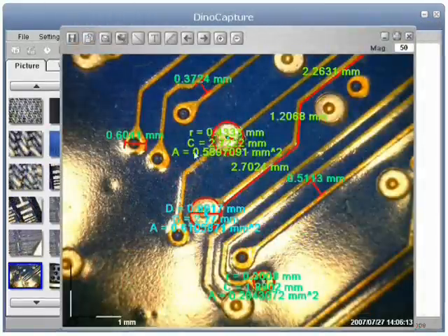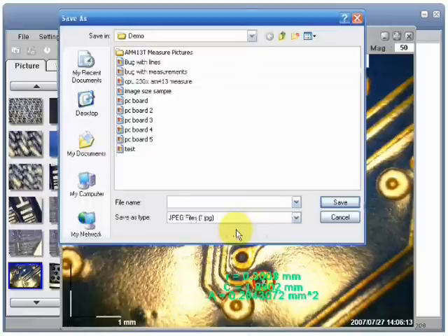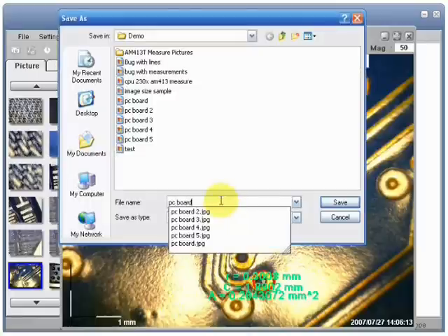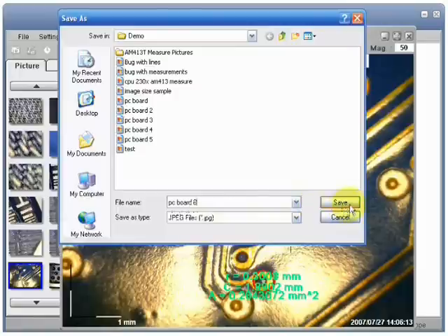To save a picture, click on the save icon. Select the size you want. Press OK. Then name and select destination folder for your picture. Select save when done.